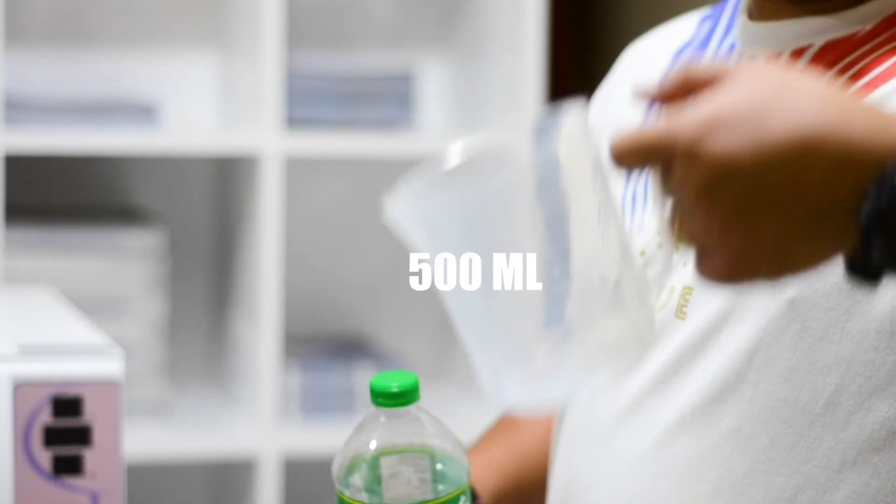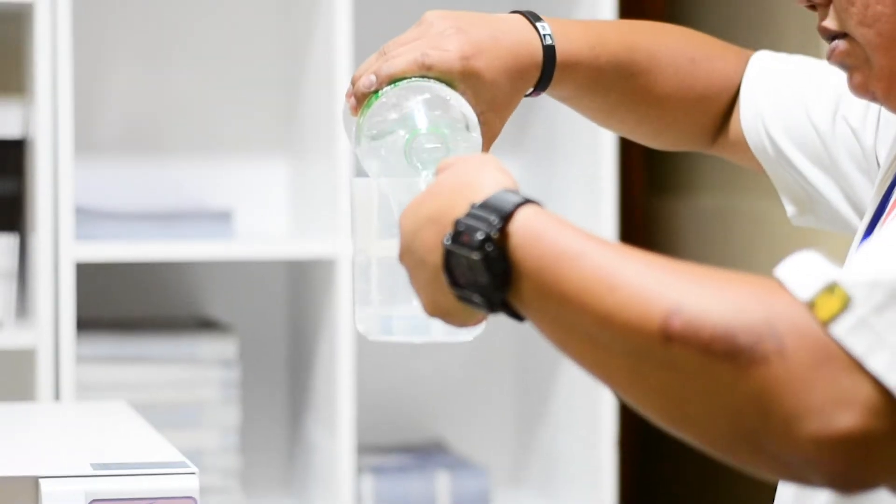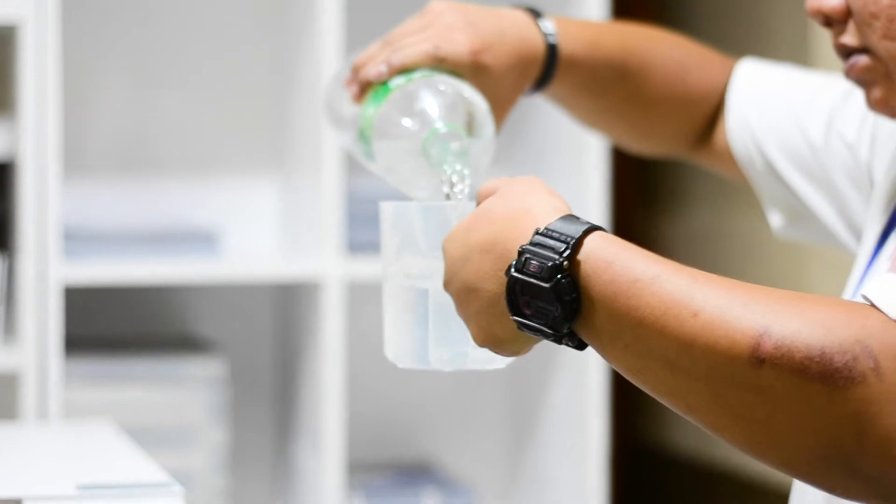Measure 500 milliliters of distilled water. Note that purified water is not distilled water. Use only distilled water.